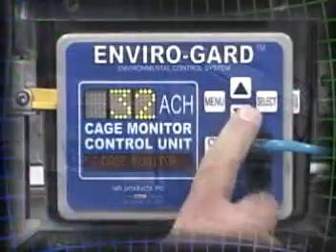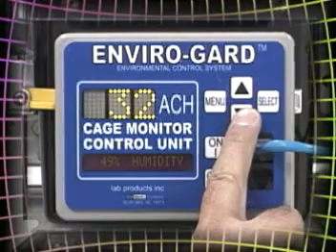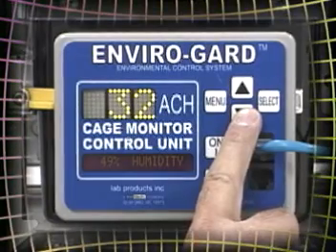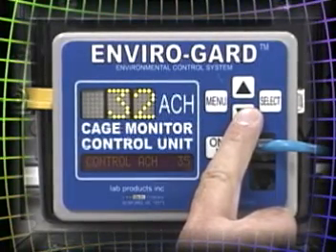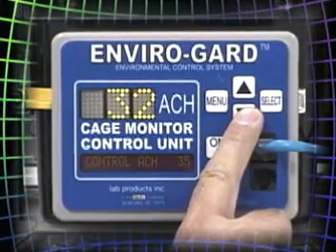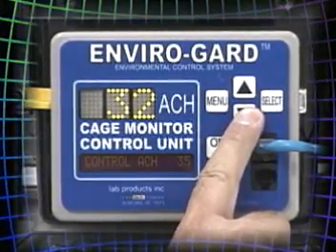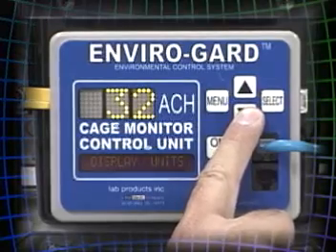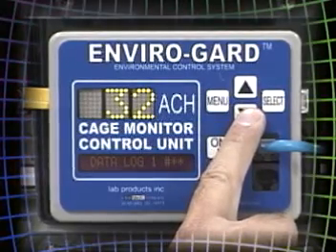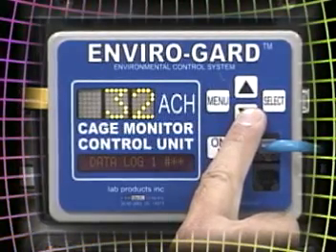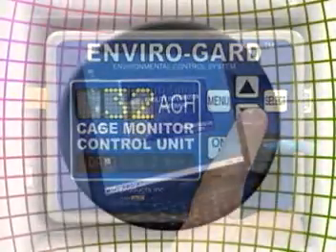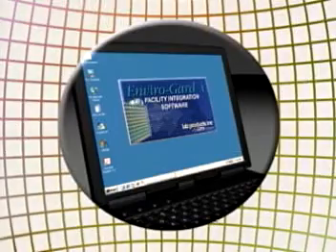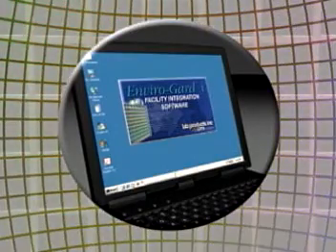You can continuously monitor and record cage air exchange rates, temperature, relative humidity, ambient light levels, and store data on board the cage monitor control unit or download it directly to your PC.